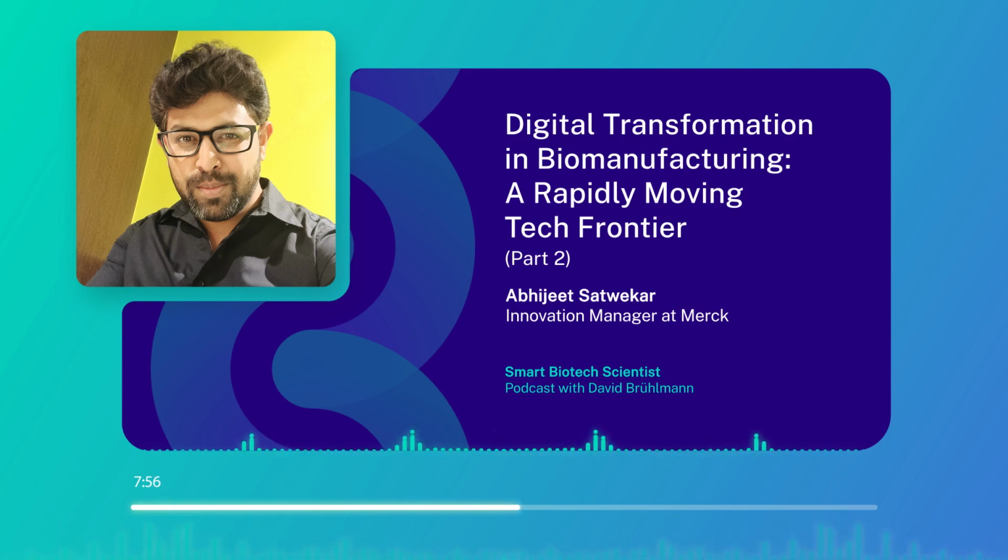Now, smart biotech scientists, you're probably convinced that using PAT is a great idea, but you might be wondering, where should I start? What should I do? So let's roll up our sleeves and get very tactical. Abhijeet, can you help us get started? What are the few simple steps we should take to start using PAT?